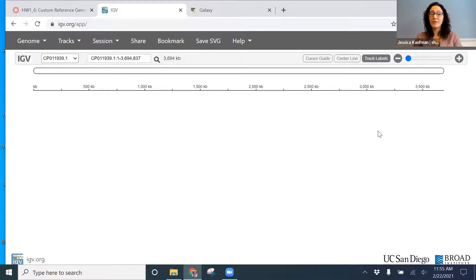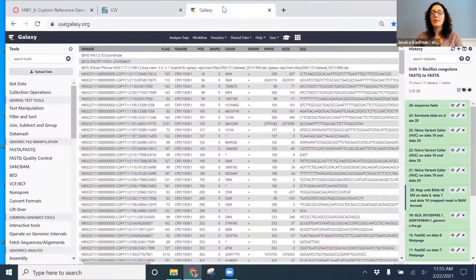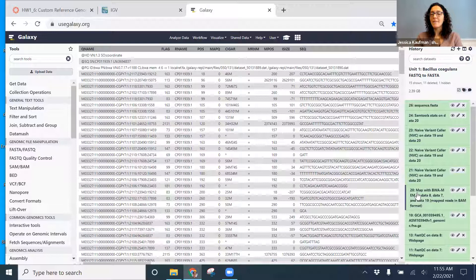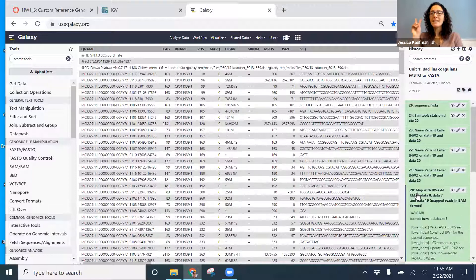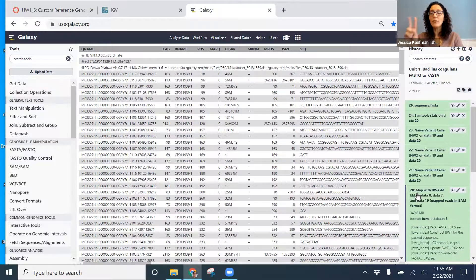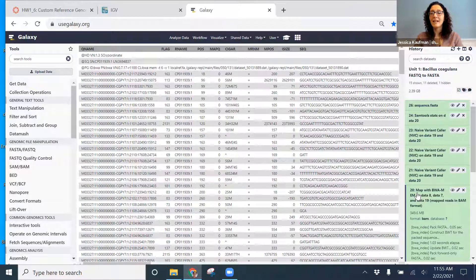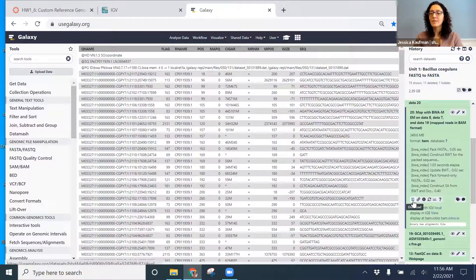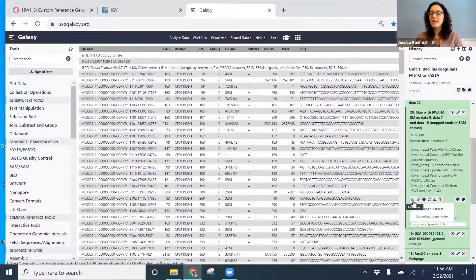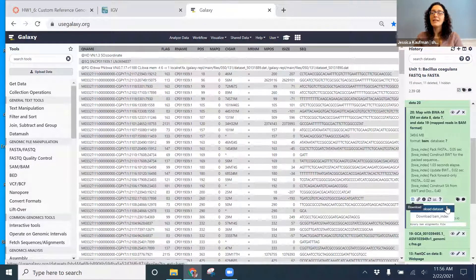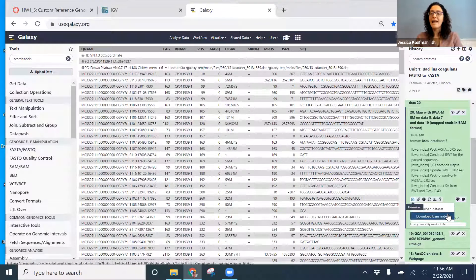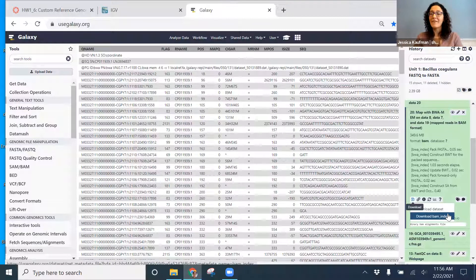Once you have your reference genome loaded, you go to Galaxy and you go to your mapping step. You have to download two files in order to view the data on IGV. So when I click this download button, you'll see two things come up: Dataset is the BAM file, and BAM index is the BAI file.